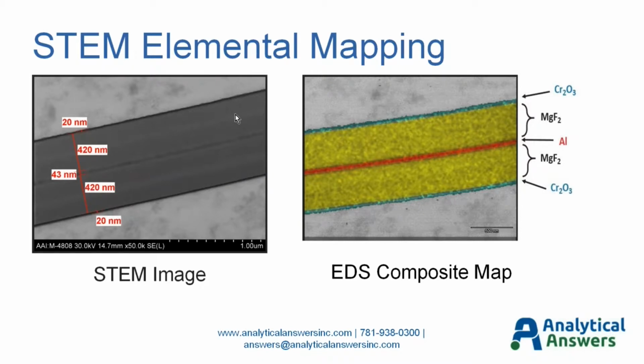And I just want to highlight the fact that we have these 20 nanometer-ish films on either side of the flake, and they're well resolved here in our subsequent transmission EDS map. You can see that they are chromium oxide. So again, by doing a transmission experiment and removing all the backside material, it really allows us to maintain the resolution offered by the SEM in our elemental analysis.